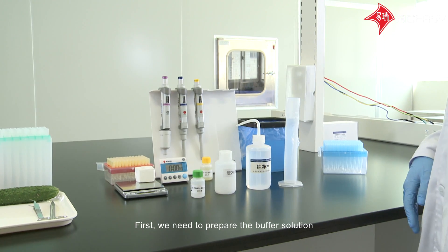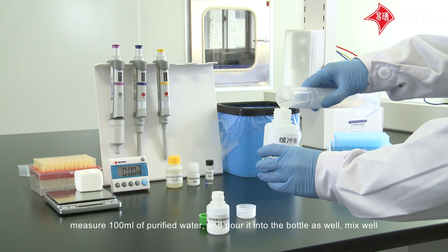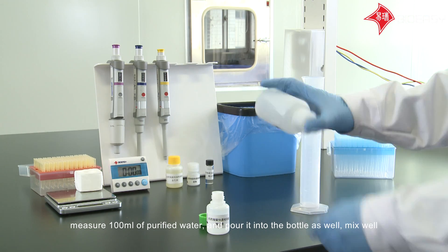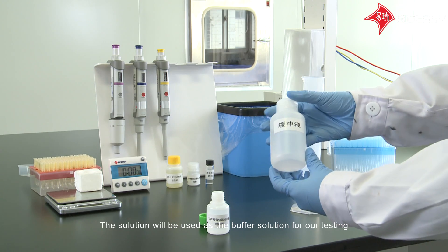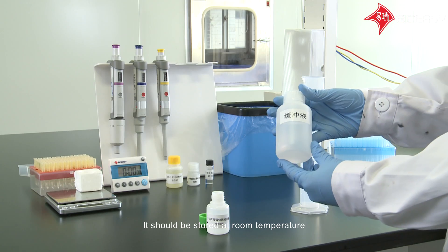First, we need to prepare the buffer solution. Take one milliliter of buffer into an empty bottle, measure 100 milliliters of purified water, and pour it into the bottle as well. Mix well. This solution will be used as the buffer solution for our testing, and it should be stored at room temperature.